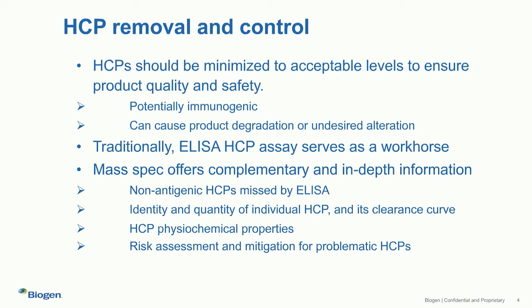In the meantime, some HCPs were reported to interact with the product and therefore affect the efficacy of the product through affecting its binding to the target. So traditionally, a multi-analyte ELISA HCP assay is the workhorse for HCP monitoring for biopharmaceutical development.